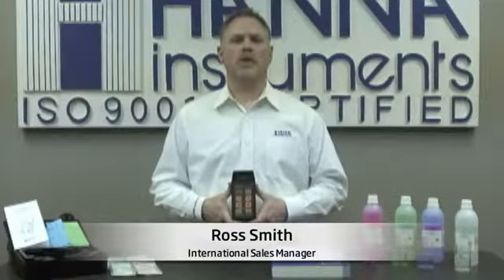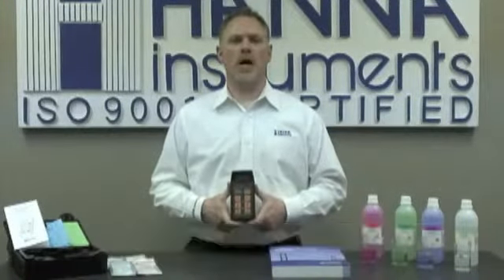Hi, I'm Ross Smith with Hanna Instruments. I'd like to introduce you to the HI8424 portable meter. This unit measures pH, millivolt, and temperature in Celsius.